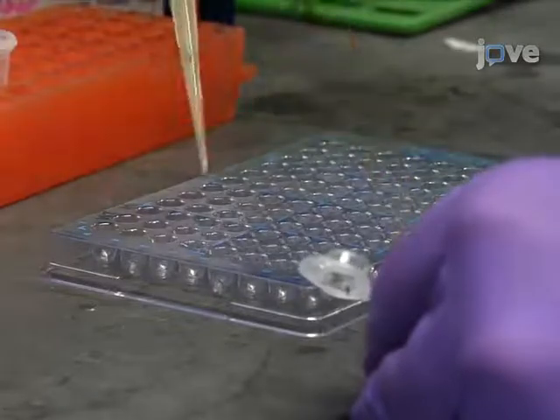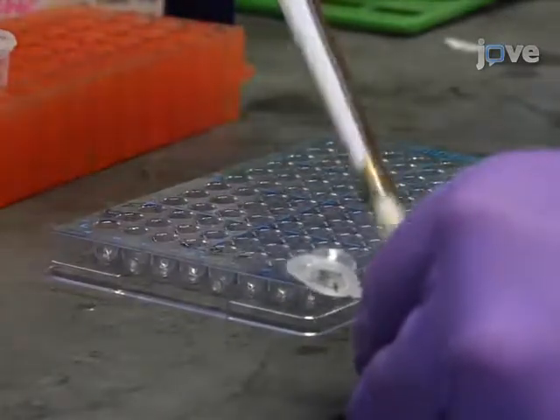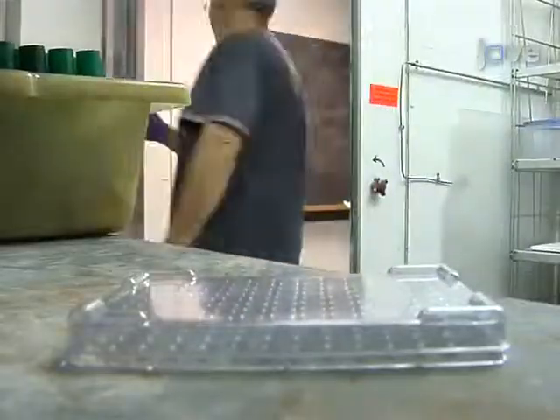Next, using a pipette, transfer 100 microliters of diluted culture into separate wells of a 96-well round bottom plate. Incubate the plate at 37 degrees Celsius for 4 to 24 hours to allow for biofilm growth.